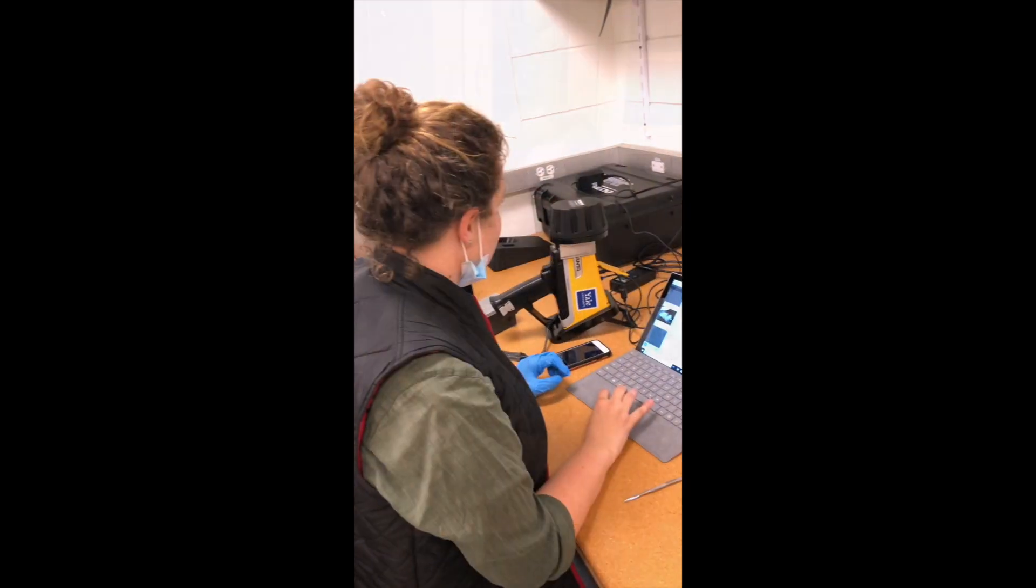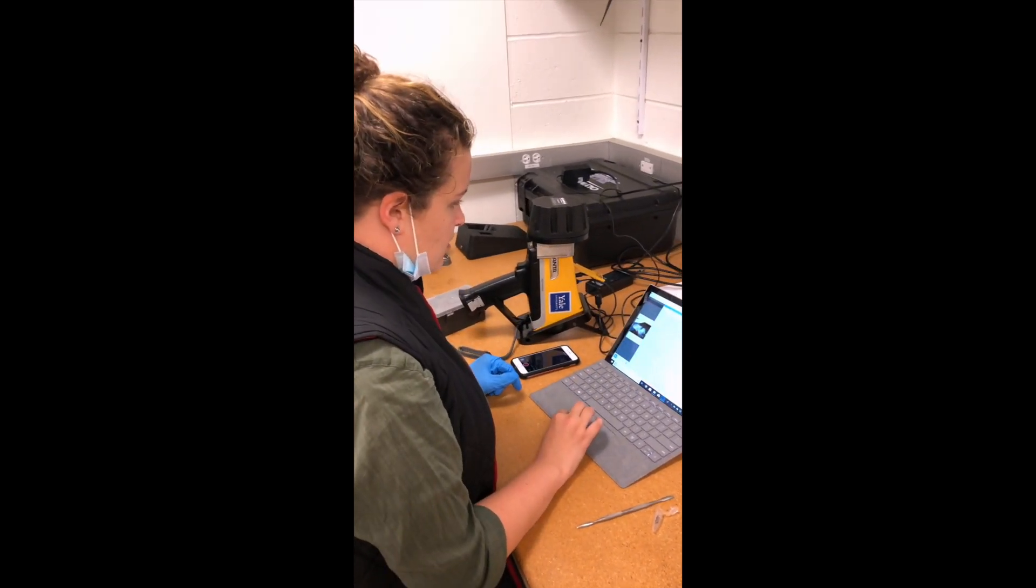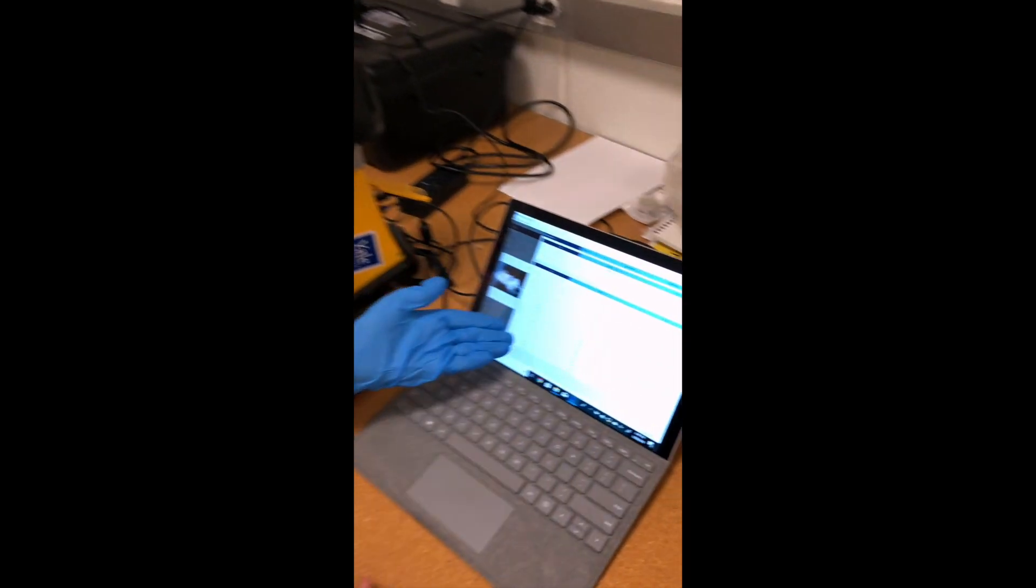Smells like death. Before burying our bones, we needed to first run preliminary tests to establish a baseline for interpreting our final results. Using PXRF, we will measure the elemental composition. Our lid is on our PXRF, our sample is inside. I'm going to press play. There it is in action. You can see all of the elemental parts per million popping up on the screen there.